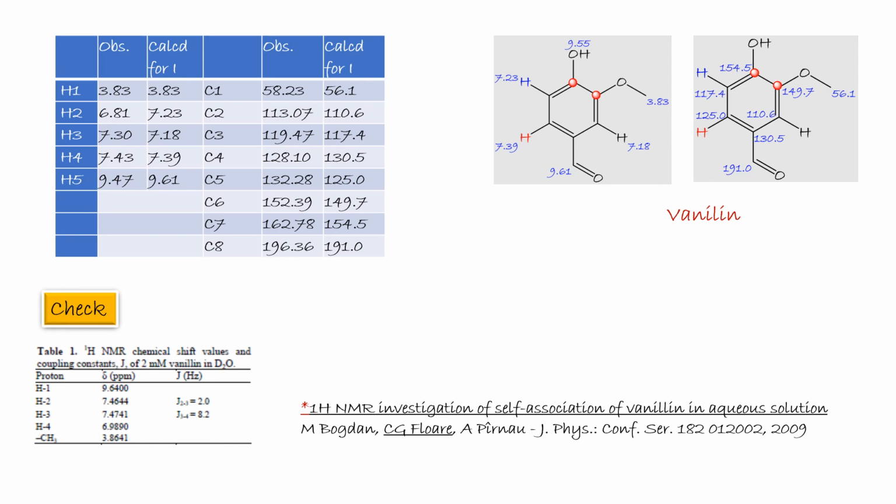For the final check, the calculated and the observed. This is observed for proton, matching well. And the 8 carbons are matching well.